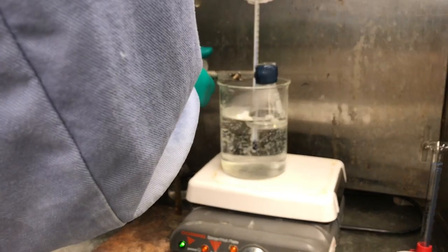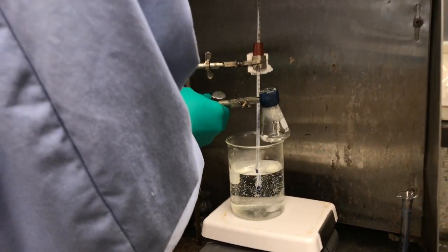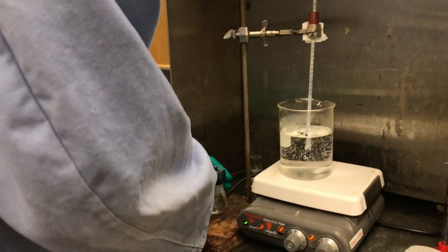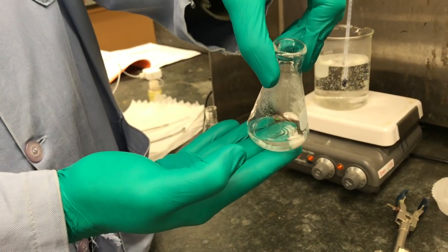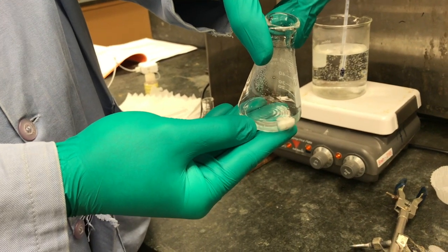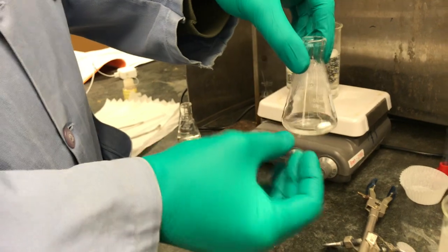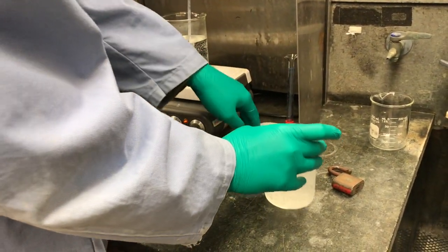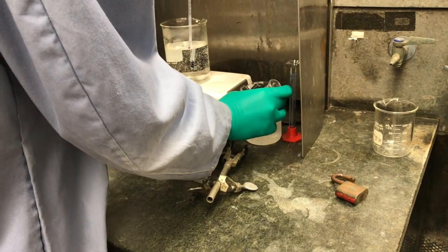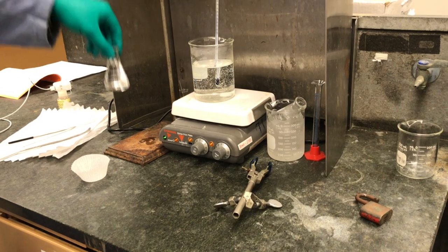So it's been about 15 minutes, so we're going to take out our reaction. I think this is good. Okay. So we can see little white pieces that seem to have precipitated, so that is probably our product. We'll cool this in an ice bath. And then we'll add 50 milliliters of water.